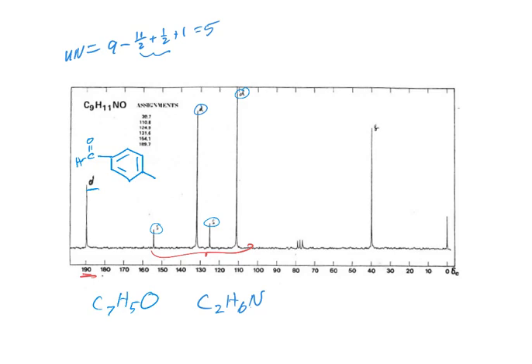And we've essentially accounted for all of this so far. So all we have left is those three peaks over there at 80. These are CDCl3, 77.0. So a lot of times you'll see those in there, and we'll just learn to recognize those.